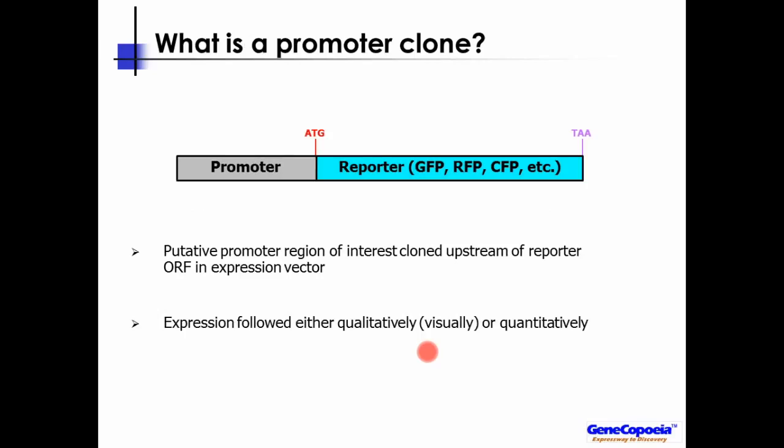Now, traditionally, the earliest reporter promoter clones took such a promoter sequence. Either it was already functionally defined, or it was one of these cases like I just mentioned where we arbitrarily determine a sequence, and just that sequence is hooked up to a reporter like GFP, a fluorescent reporter, or firefly luciferase, for example.